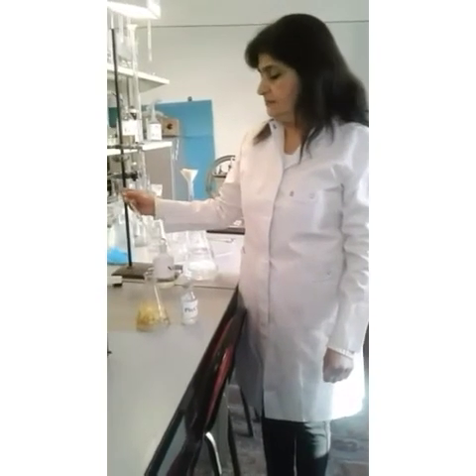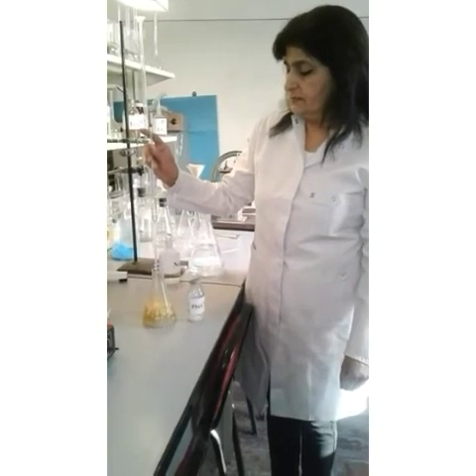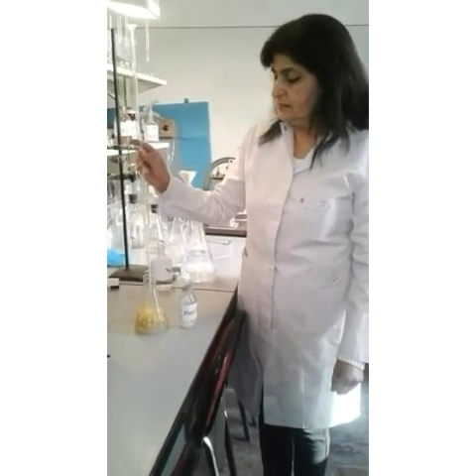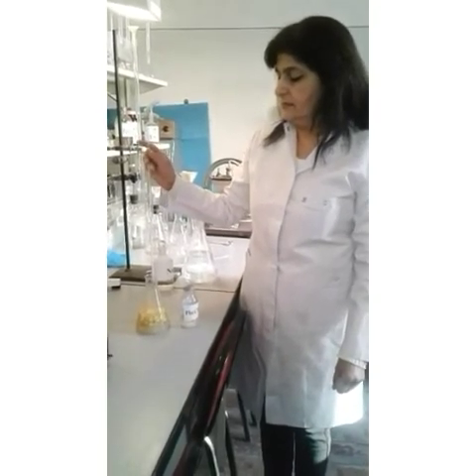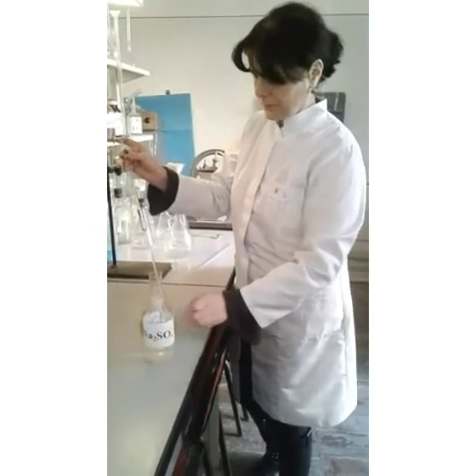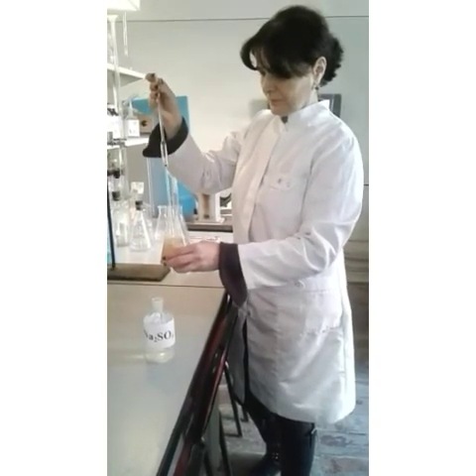We add 7 milliliters of 30% lead diacetate to the liquid. Mix well and allow to stand for 5 minutes. Lead diacetate precipitates organic non-sugars, such as polyphenols, dyes, proteins. We add 20 milliliters of sodium sulfate to the flask from the measuring pipette. The result is such a reaction.